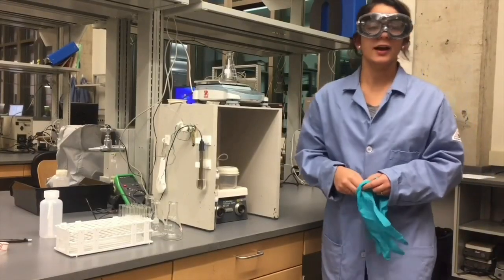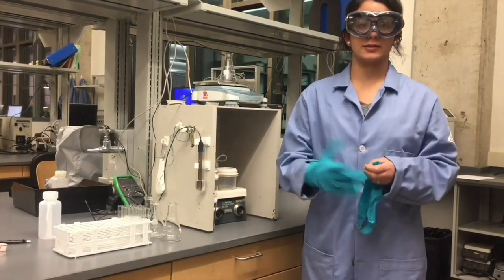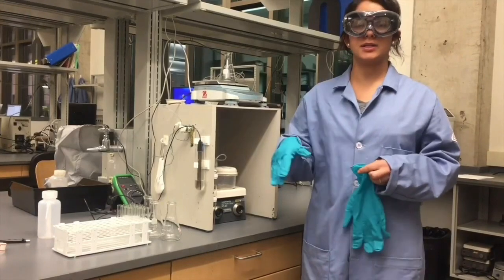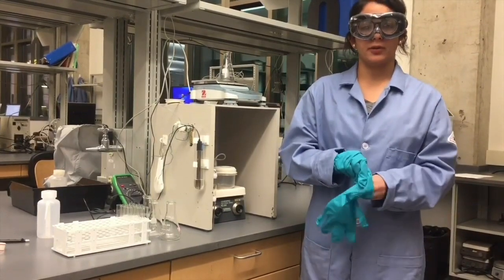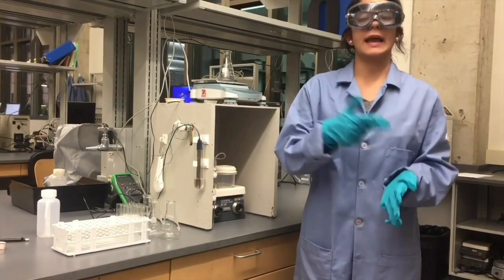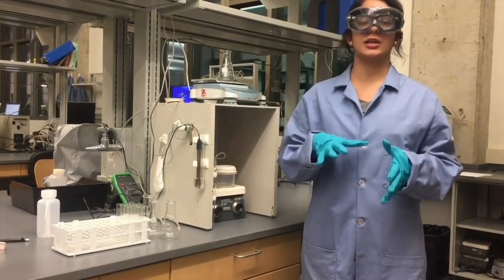Oh, hey there, Henry. So there are a few necessary steps in order to make the solutions for the ICP. We're going to need a few different solutions in order to pick out the different species that we have in our mixture. First, we're going to prepare a sample and create a series of standards to compare it to. These standards and our sample need to be within an acceptable working range of concentrations.